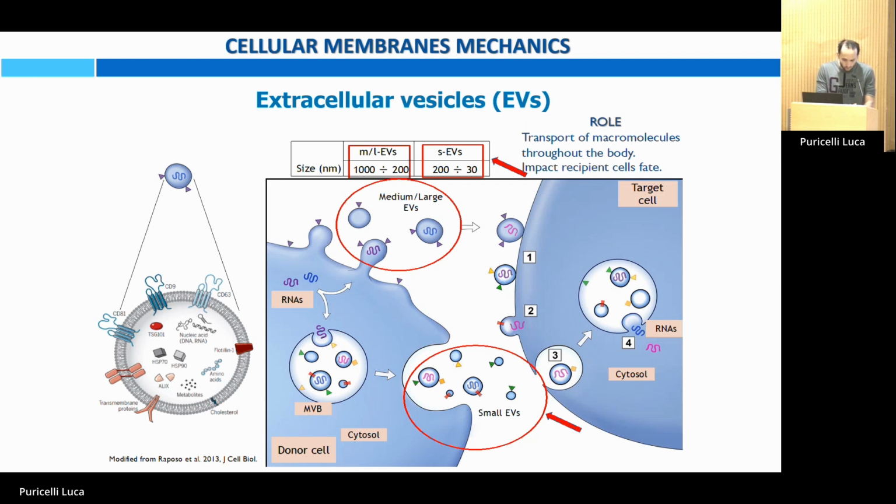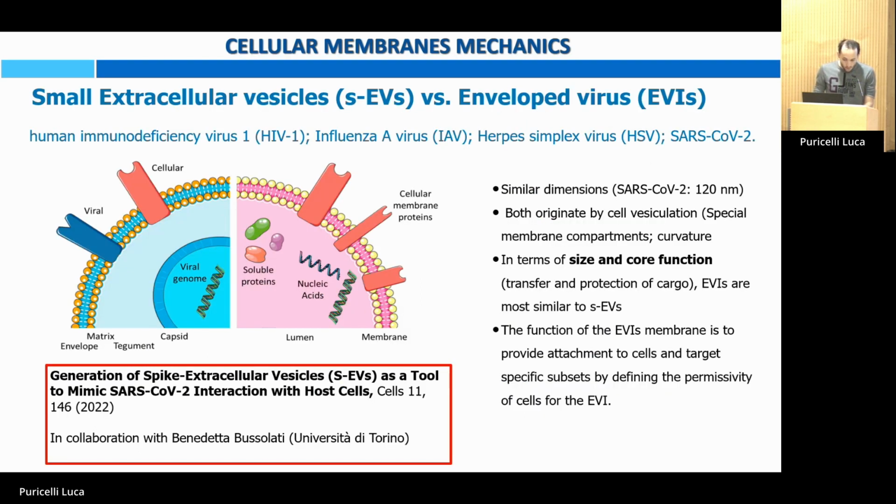But of course, as I said before, they interact with the membrane before entering the cell and releasing their cargo. So it's important to study the membrane itself, but also its relation with extracellular vesicles. There is another reason why they are important, I mean, the small extracellular vesicles.